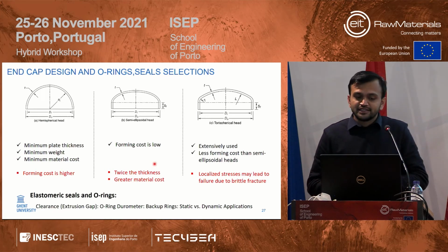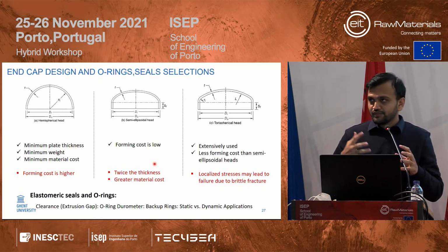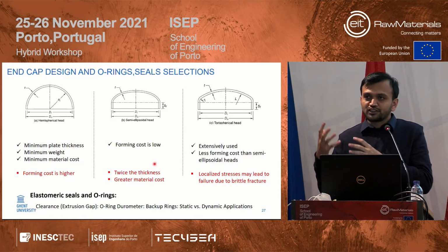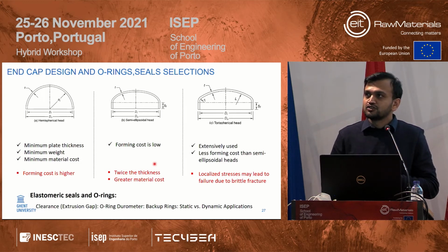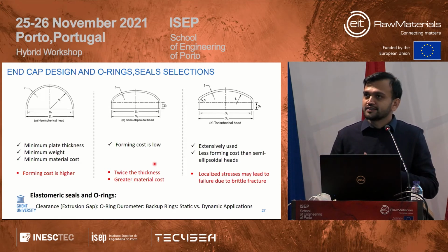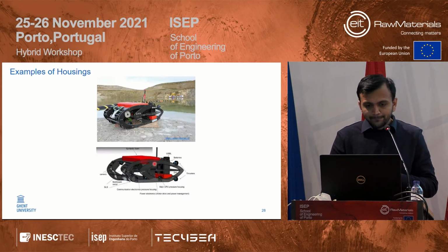Regarding the seals, the elastomeric seals or O-rings are required here to arrest leakages, or water entering inside the housings, to protect our cameras and optic fibers or photonics sensors inside the housing. A few examples of housings I'm going to show here.